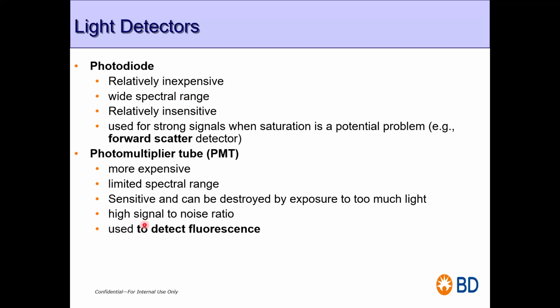But now come the photomultiplier tubes. They are expensive and high signal, I would say advanced detectors, which can detect even the smallest amount of photons. So we use this detector in our fluorescence detectors, where your blue, red, and violet laser will hit, like the signal will come. And also for the side detector, because they are a bit far away from your point of interrogation.